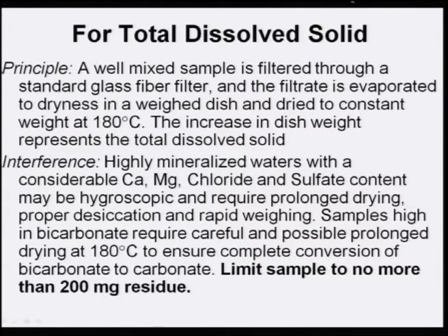degrees centigrade. The interferences that are generally to be avoided are highly mineralized water with a considerable amount of calcium, magnesium, chloride and sulphate content, which may be hygroscopic and require prolonged drying, proper desiccation and rapid weighing. And here also the residue must not be more than 200 milligram, otherwise the sample needs to be rejected.